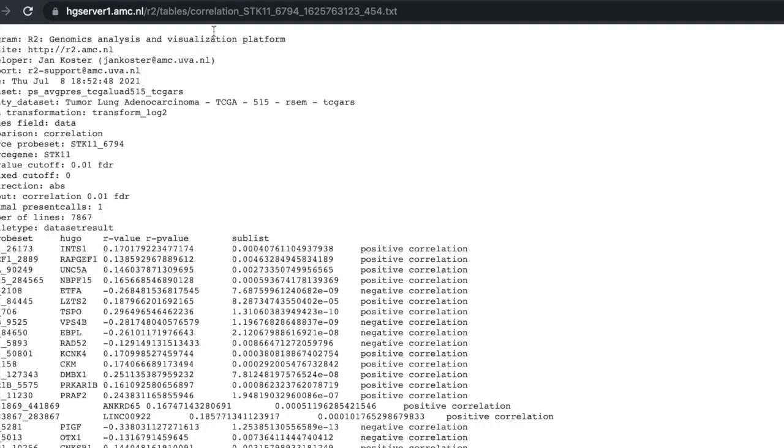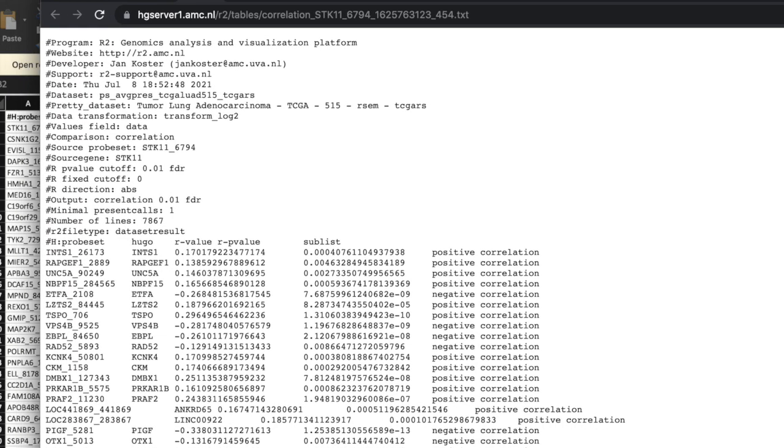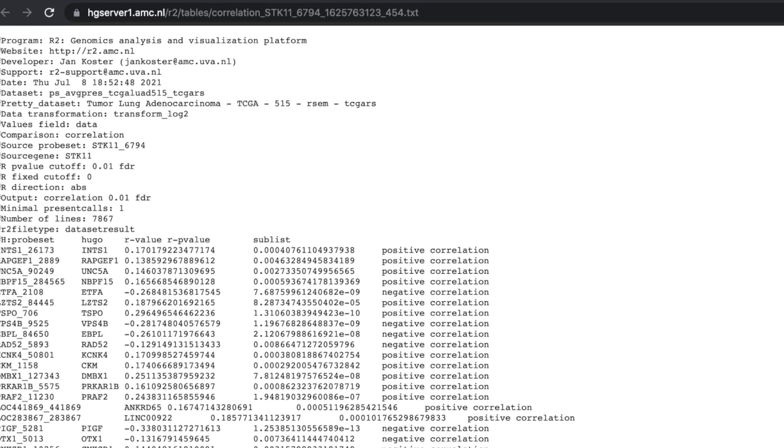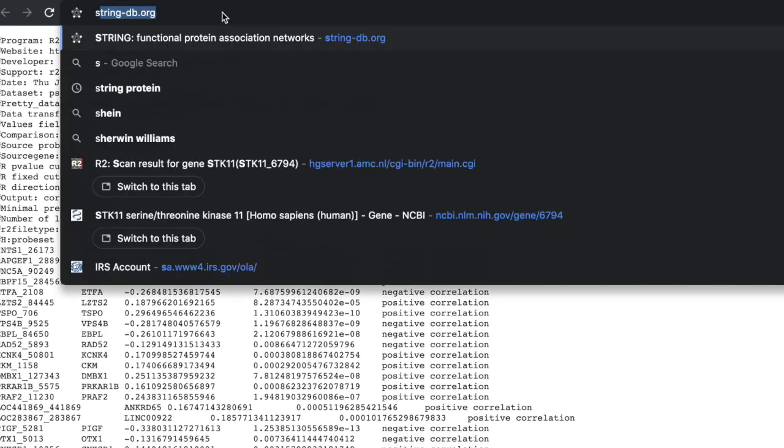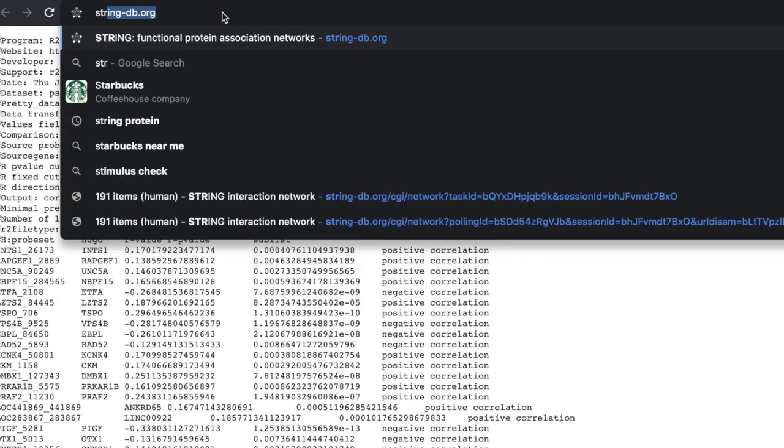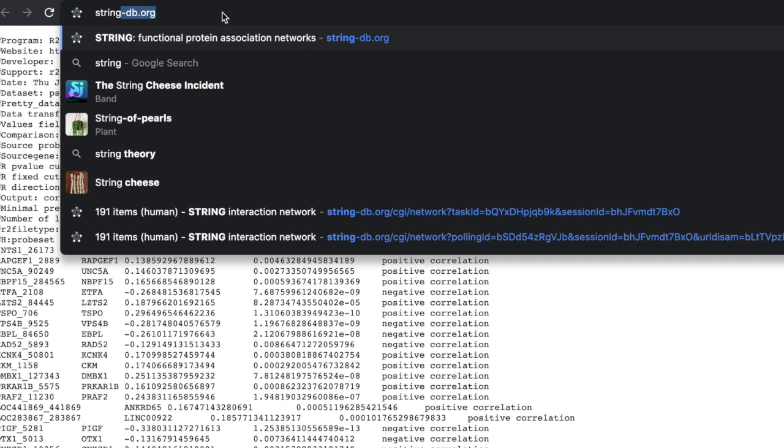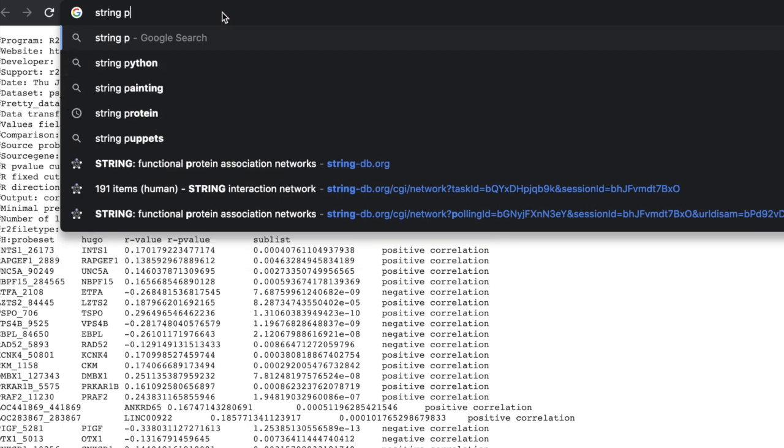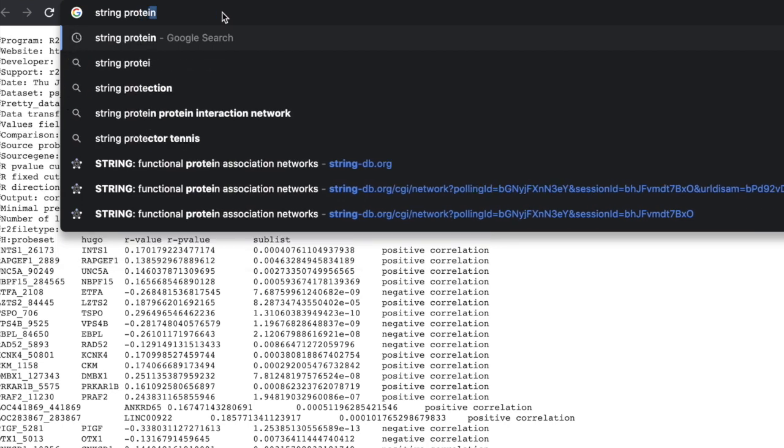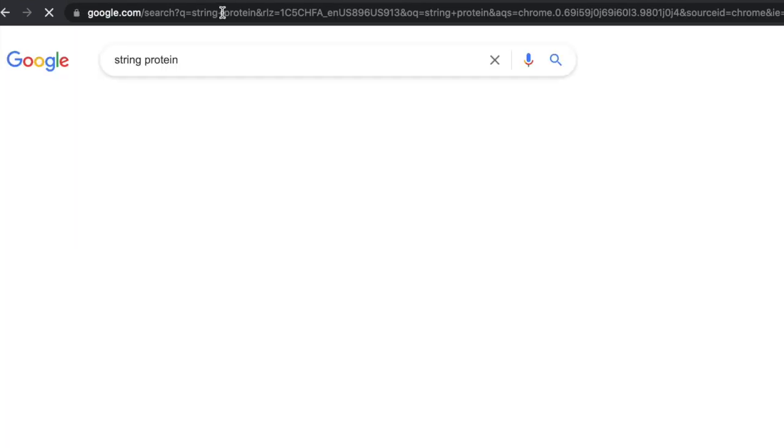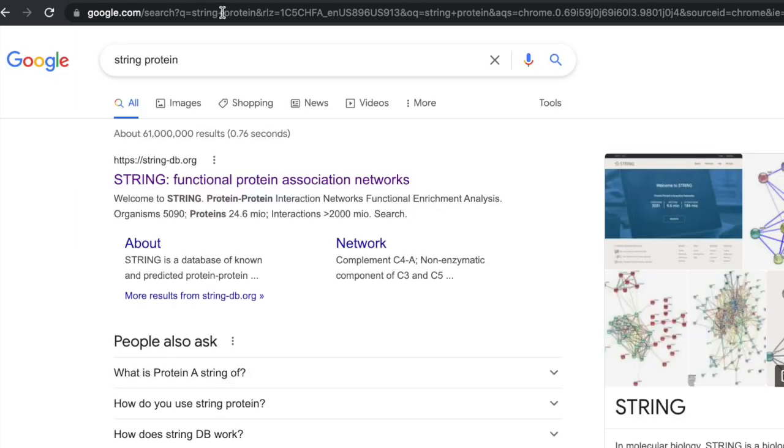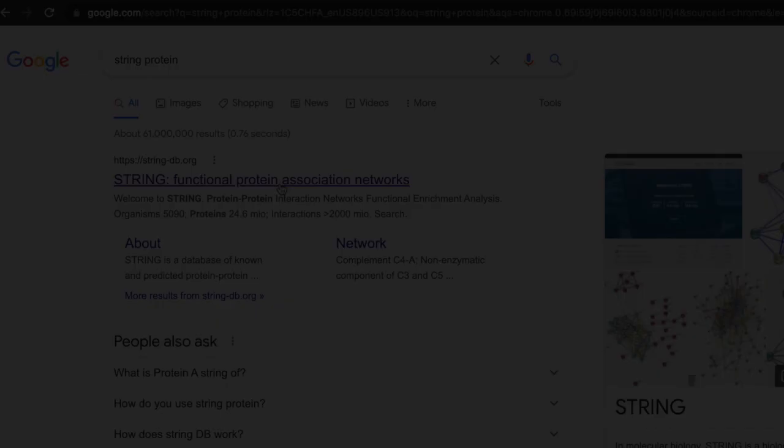Now what we're going to do is we're going to go back to your browser. And here's what I want you to do. I want you to type in string and then you can put protein. You should come up with string functional protein association networks.